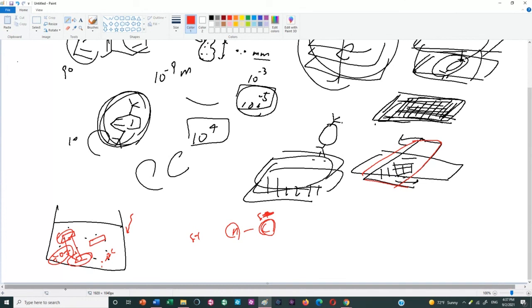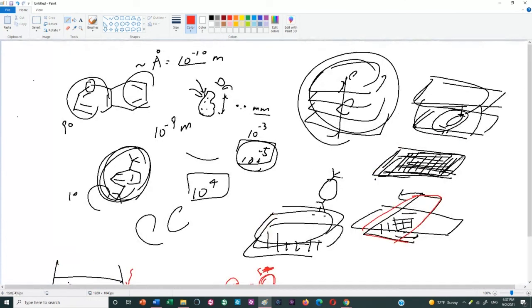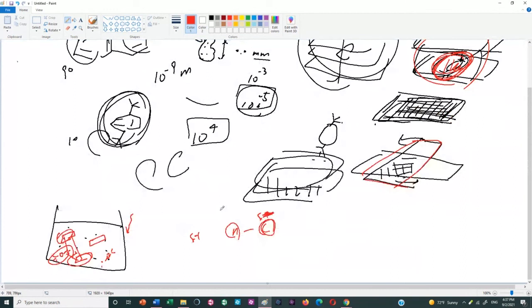And you are recapturing impurity and stacking with the impurity, making a crystal that is not as stable, but also, what's the purpose of this experiment? Leaving this thing in the solution, right? But you recaptured it. So you have to do it very slowly.